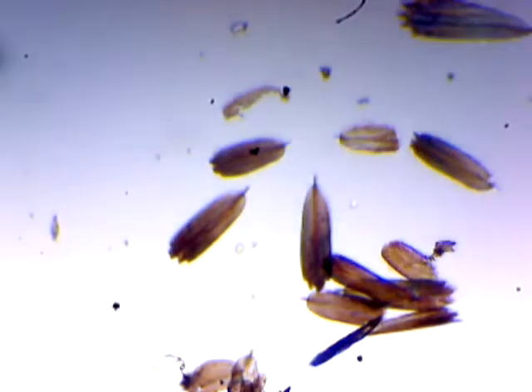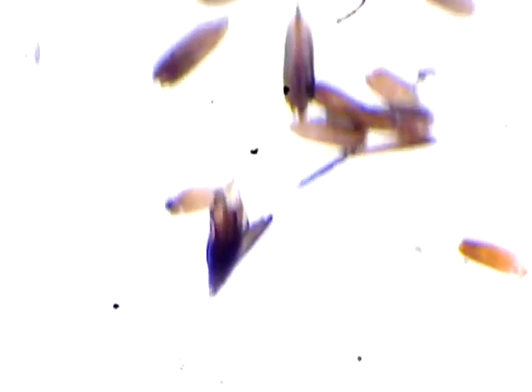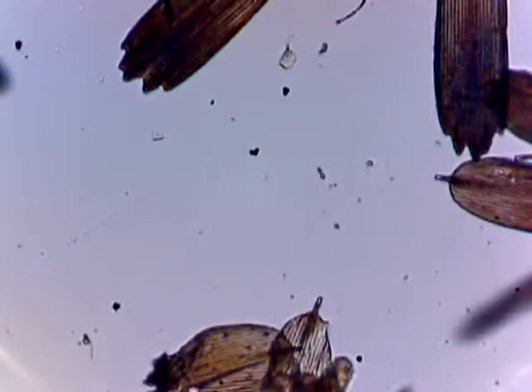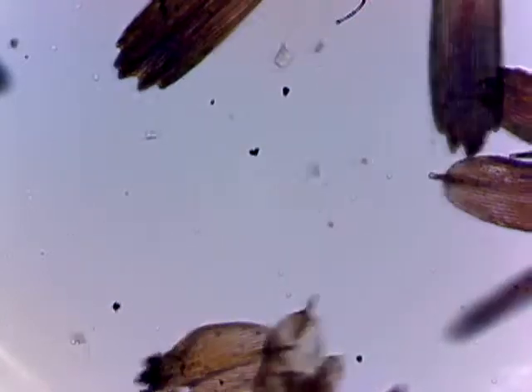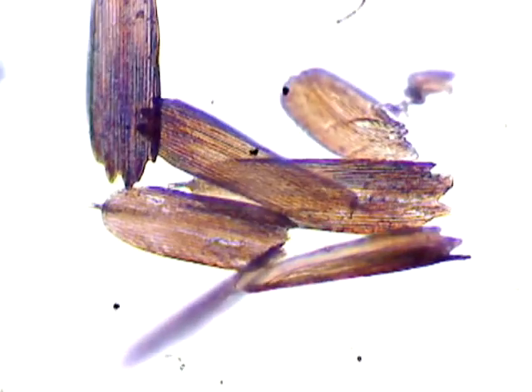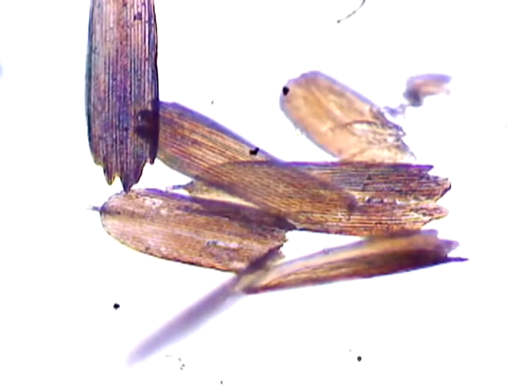Let's adjust the condenser a bit. Notice how dramatically that affects the appearance of the image. I'm messing with the condenser lens only. The colors get warmer as I lower the condenser lens away from the slide, and details get much higher contrast. This is why having an adjustable condenser is so important. Now that I've increased the magnification, I can put the condenser back up closer to the lens to get better light, and I don't suffer as much of a contrast loss as with the lower power objective.